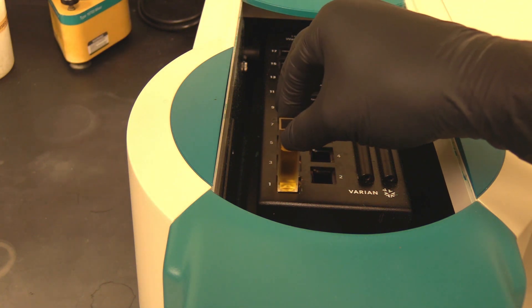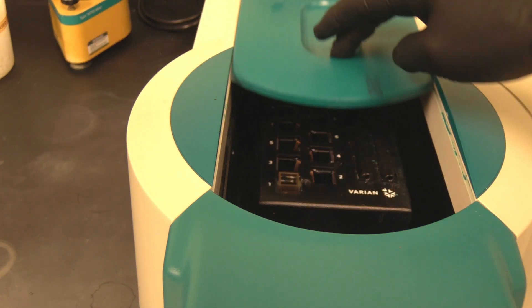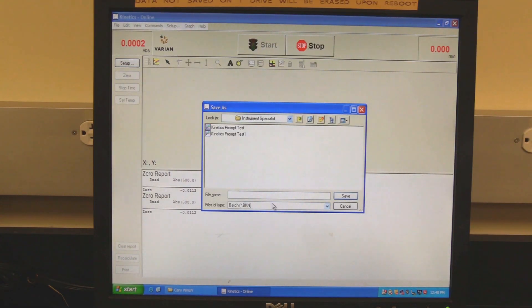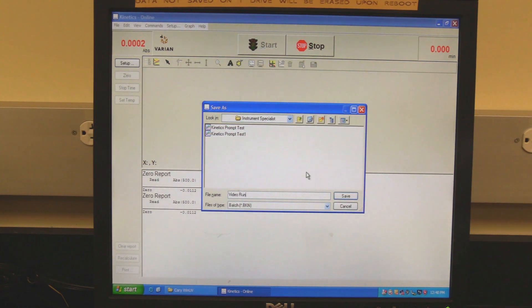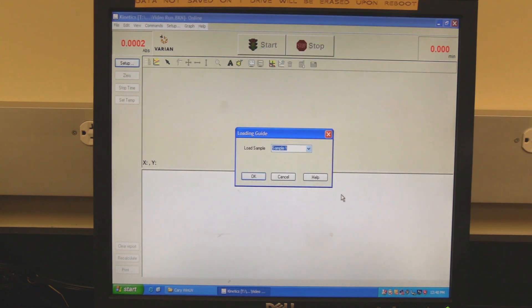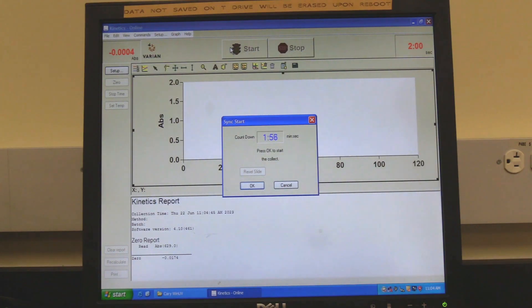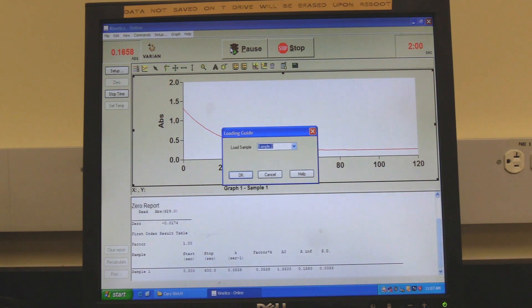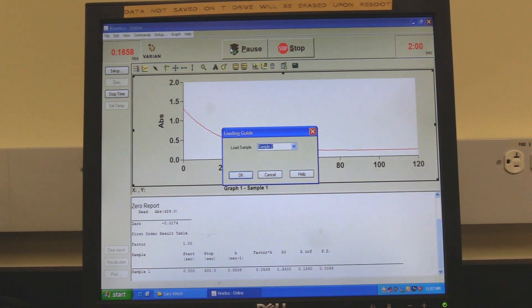Insert the sample cuvette in the sample chamber as demonstrated in the wavelength scan measurement. Click on the Start button. If Save at Start was selected, the software will prompt the operator to save. Find the appropriate folder, name the file, and click Save. The software will prompt for the sample name — click OK. The countdown timer will appear. Add the reaction reagents to the cuvette in the sample chamber and click OK. Wait for the measurement to finish; the spectrum will appear. The software will prompt for the next sample name — if measuring another sample, click OK. The report area will have the calculated data.